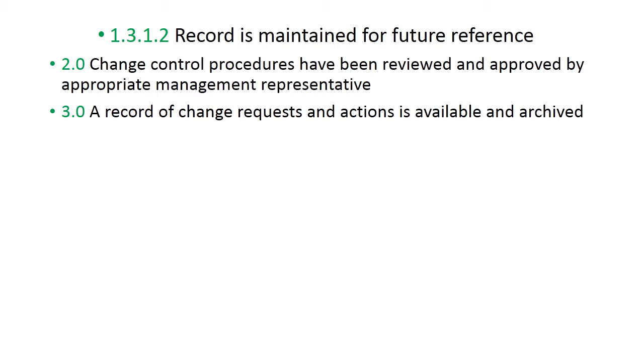Now, there is a different set of procedures when you want to exercise this change control. There is a different set of standard operating procedures. So here the laboratory management representative would ensure that the person who is bringing this change into a previously approved document is following proper procedures or not. A record of change request and action is available and archived.